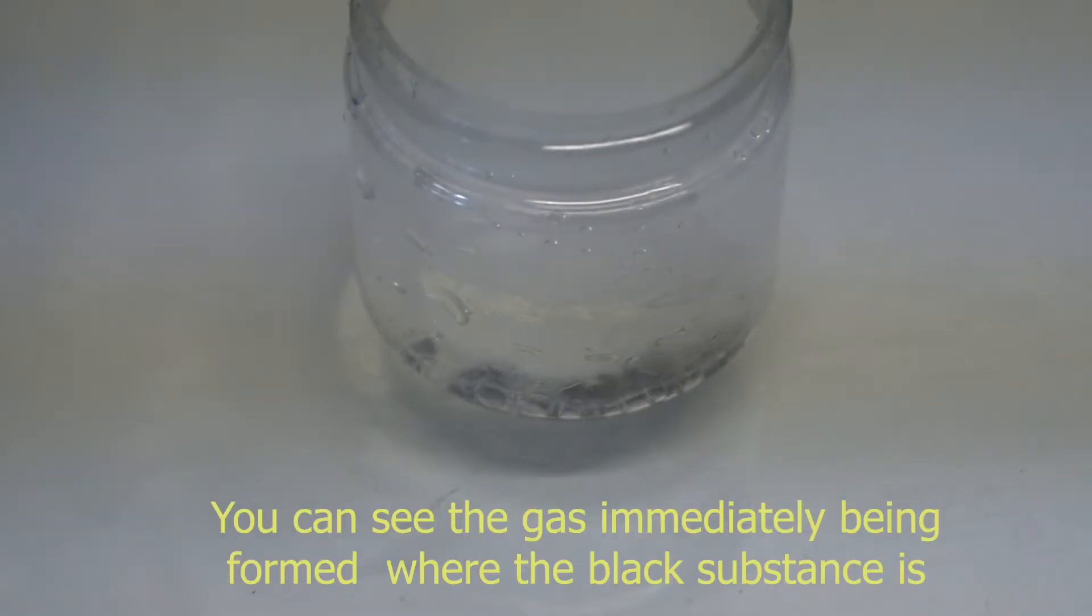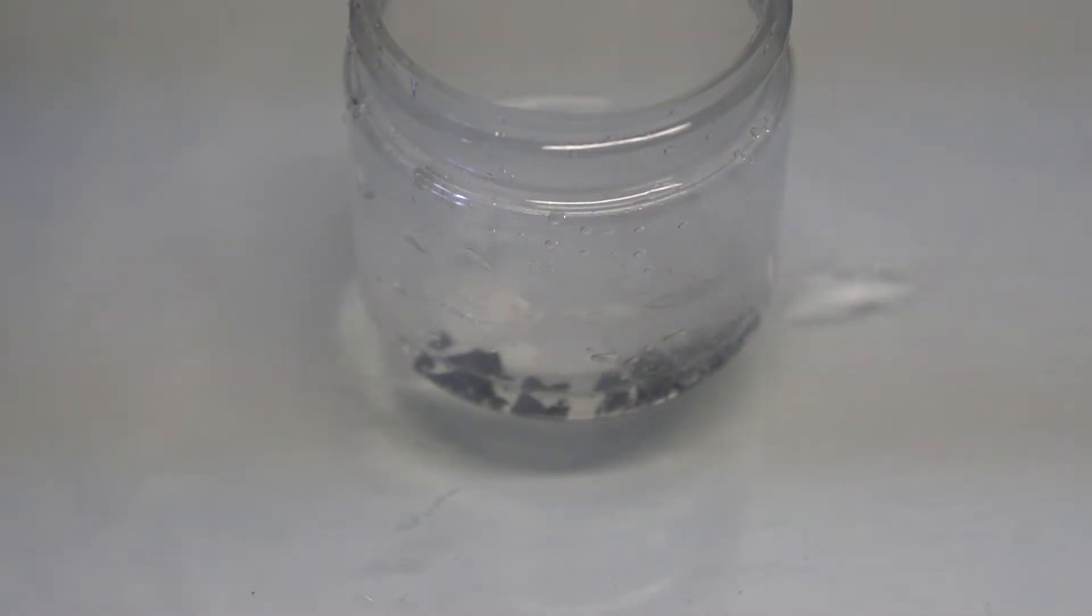Sure enough, when we added hydrochloric acid, rapid bubbling of a gas immediately started. This meant the substance was most likely elemental zinc, and now we had zinc chloride.